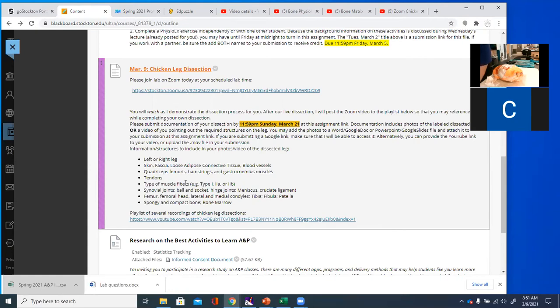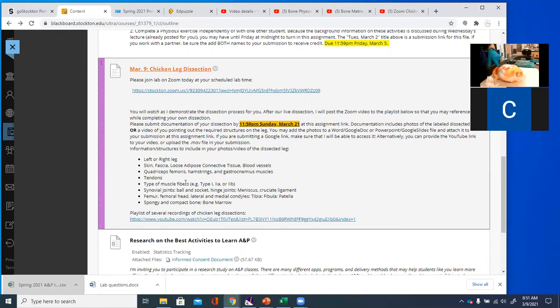Remember from lecture exam two I talked about chicken muscle specifically. This is the leg — so what kind of meat, what kind of muscle cells make up this muscle, as opposed to the breast meat? The leg is dark meat; the breast is a different type of cell entirely.